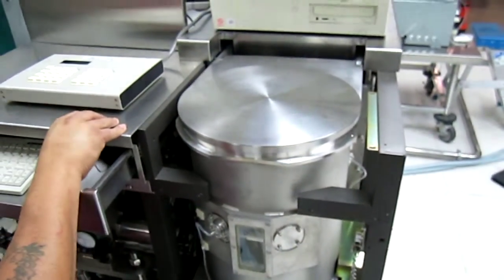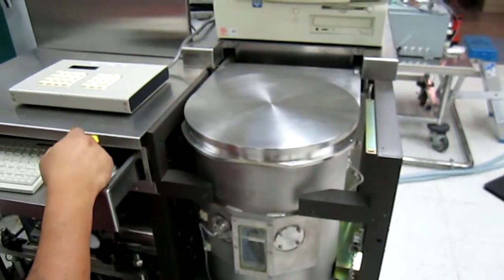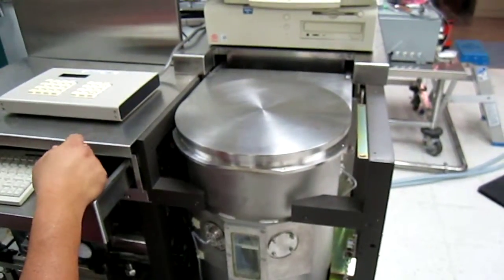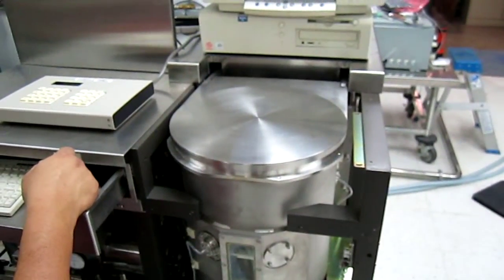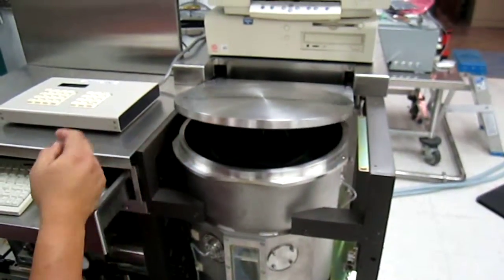We've been having problems with the lid — it doesn't want to get past the first stage of opening, as you see.